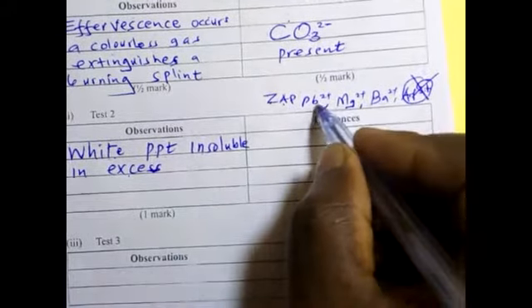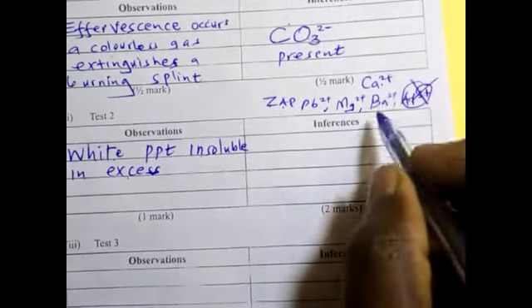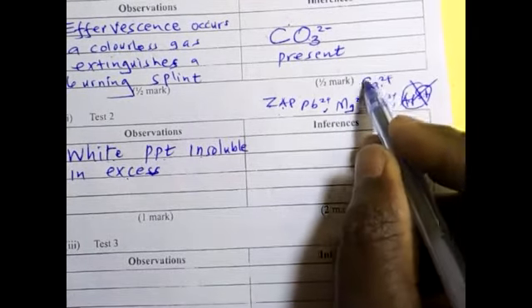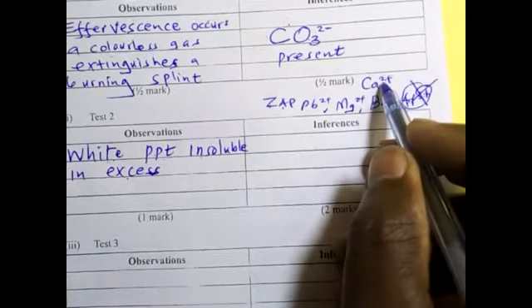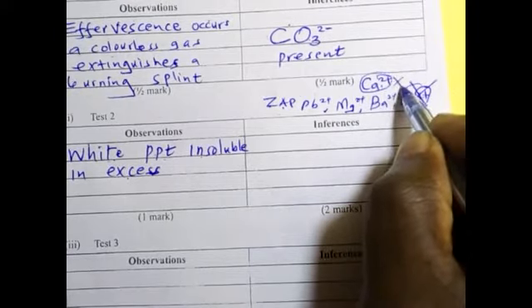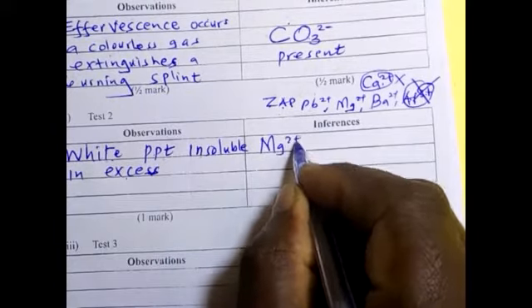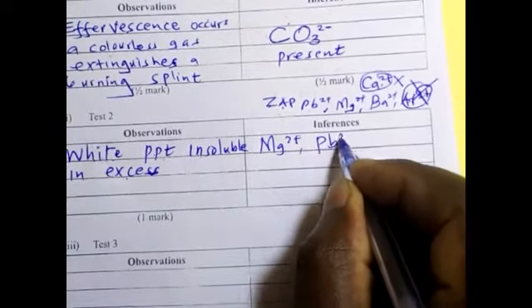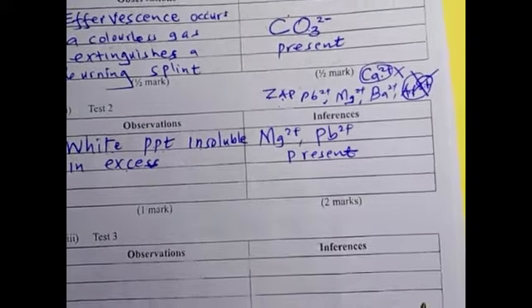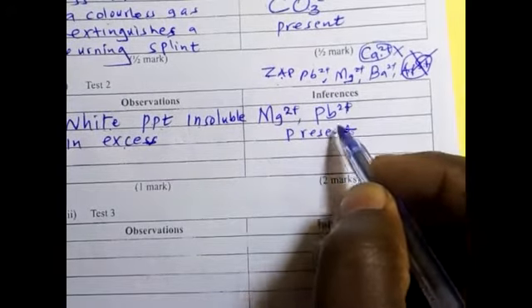Also, what I'm leaving out is calcium ions. Calcium ions are also present. So, what we are going to say, calcium cannot be precipitated by a weak base, ammonia. Therefore, calcium ion will be disqualified from there. So, what we are going to remain with is magnesium 2 positive and lead 2 positive present.